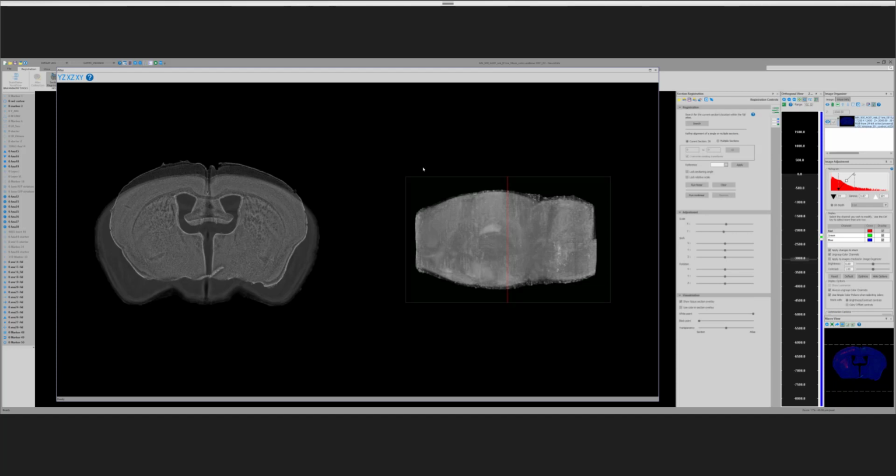What we found is that almost all of our brains are Nissl stained, so the images are different from the 2 photon images. So we generated an average Nissl brain that was then very precisely registered to the Allen space. The coordinates in our average Nissl brain, which was generated from 70 to 80 original brains, are what we use to register. The program does enable using different starting atlases for registration. The one we're using now is an average Nissl.